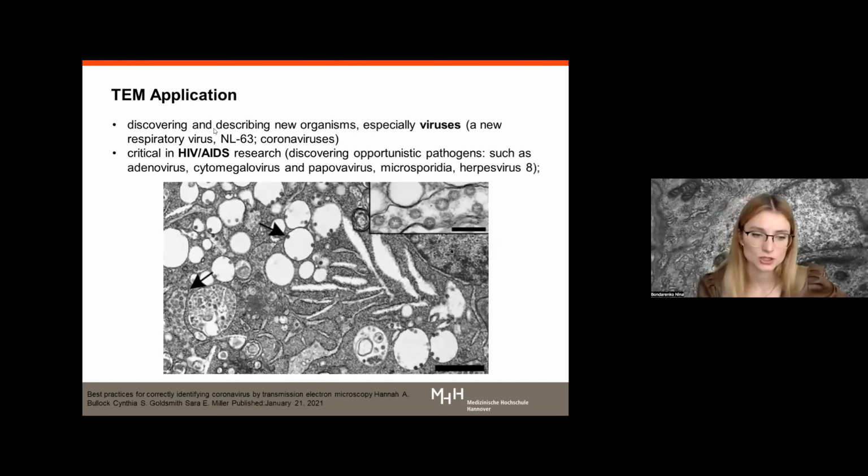So, TEM application. When can we use transmission electron microscopy? When can I advise to use it? Certainly, TEM still continues to play a critical role in discovering and describing new organisms, especially viruses.